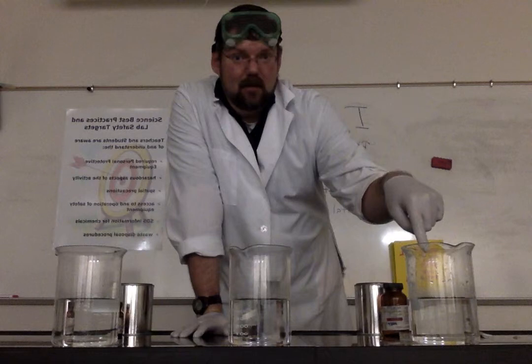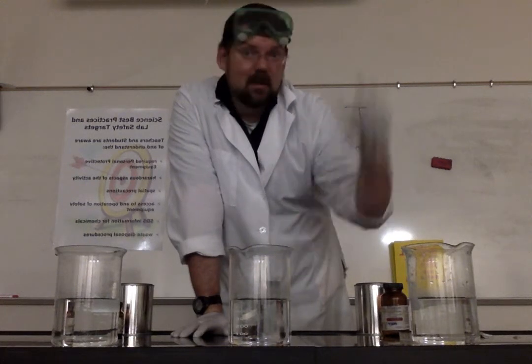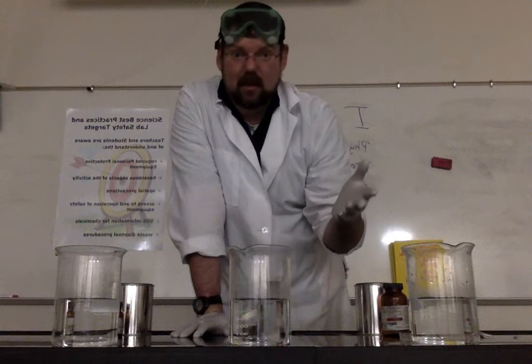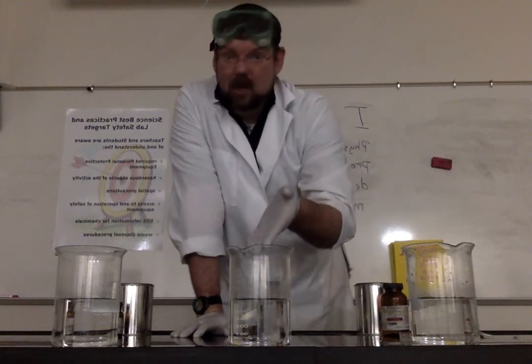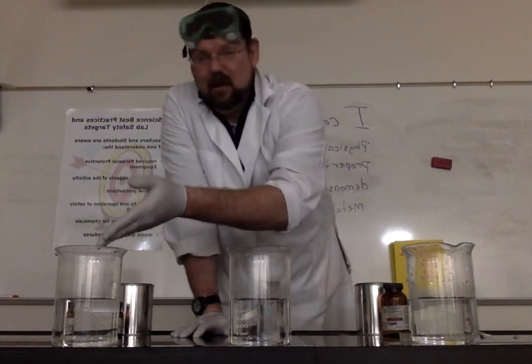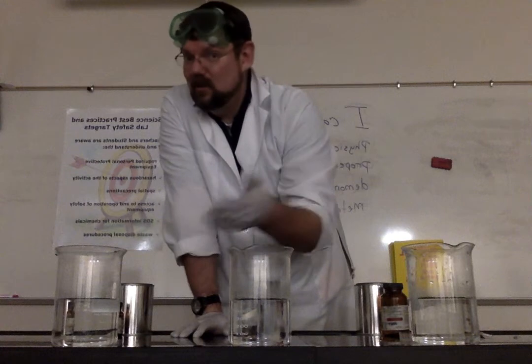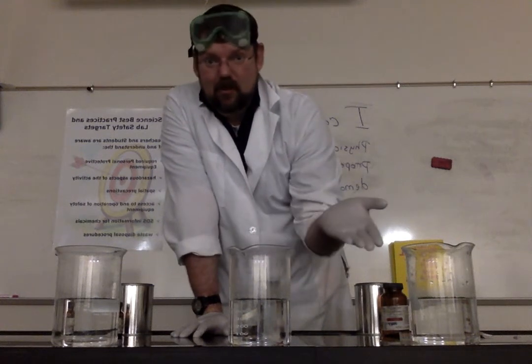Here I'm making lithium hydroxide, and I said it's corrosive to skin, so I'm pretty sure I'm not going to drink it, and I'm not just going to go ahead and throw it out to where any animal can get it. It has to be specially contained. Sodium hydroxide, also known as lye, is very corrosive, and potassium hydroxide, well, as I'm going up, it's more reactive. You can just figure out that's probably worse off than the other two.